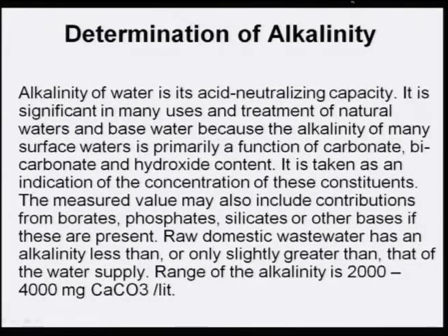Determination of alkalinity. Alkalinity of water is its acid neutralizing capacity. It is significant in many uses and treatment of natural waters and wastewater because the alkalinity of many surface waters is primarily a function of carbonate, bicarbonate and hydroxide content. It is taken as an indication of the concentration of these constituents.